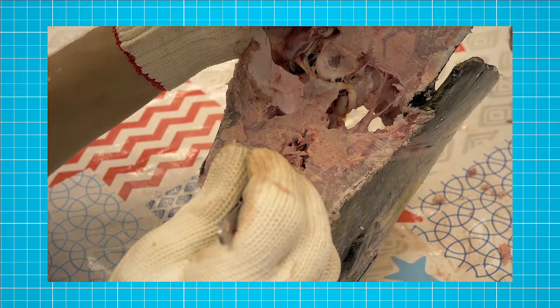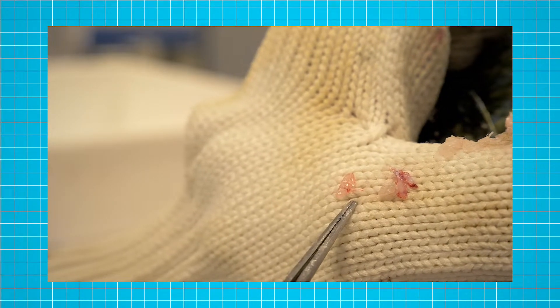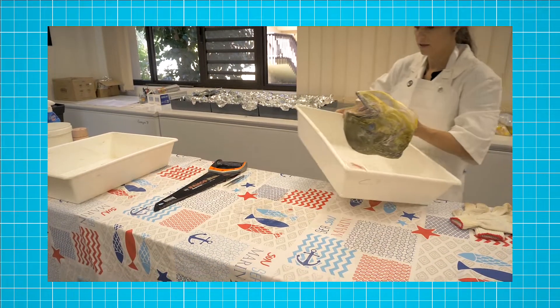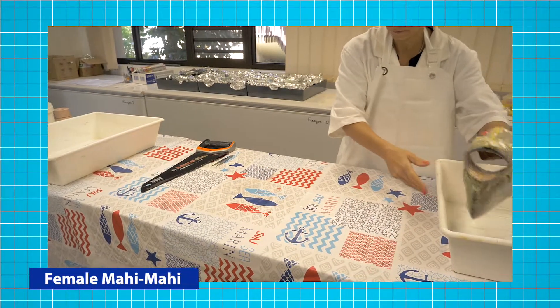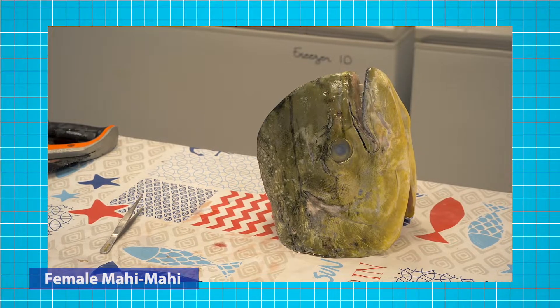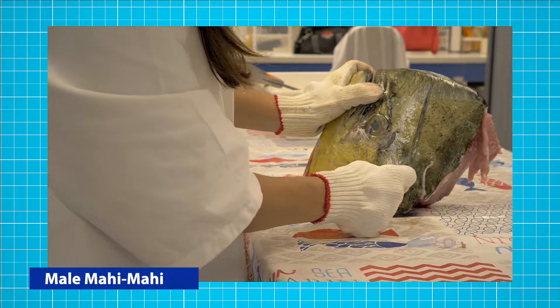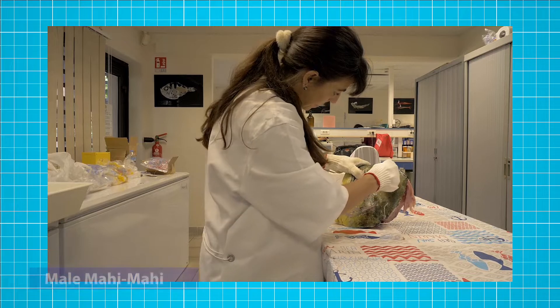Mahi-mahi otolith extractions are extremely complex and difficult. I think it's one of the most difficult otoliths I've ever collected on site. The first thing you need to check is if you are extracting the otoliths from a male or a female mahi-mahi. The shape of the head is different — it is more difficult to cut the top of the head of the male than a female. The male head is much larger and stronger, so you have to be more patient while cutting through.